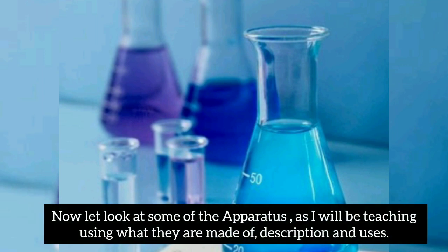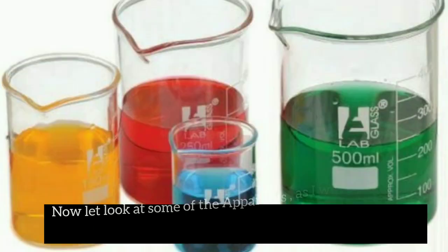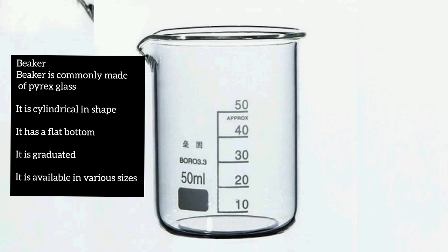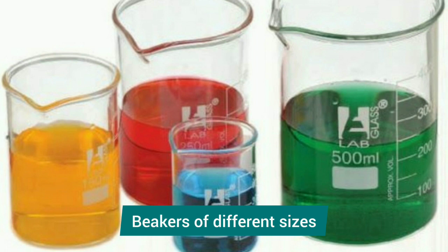Now, let's look at some of the apparatus. I'll be teaching using what they are made of, description, and uses. The first one we're looking at in this series is the beaker. Beaker is commonly made of glass. It is cylindrical in shape. It has a flat bottom. It is graduated, that is, it has measurement or scale. It is available in various sizes.